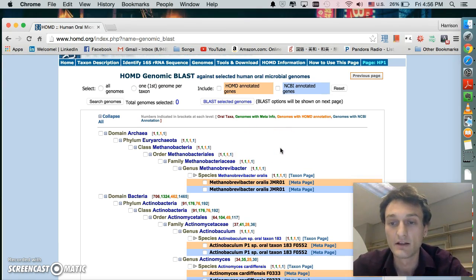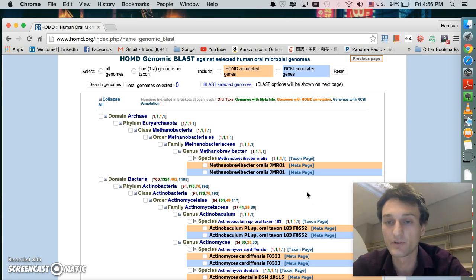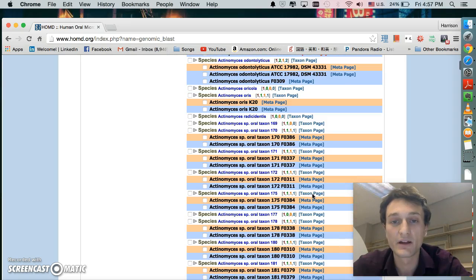What I want to do here is find the 16S rDNA sequence for one of these microorganisms. The reason for choosing this sequence is that it's an essential non-coding RNA sequence that's highly conserved amongst all species. So actually, you can just go to a random species.